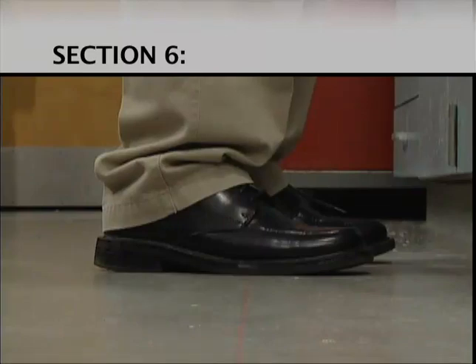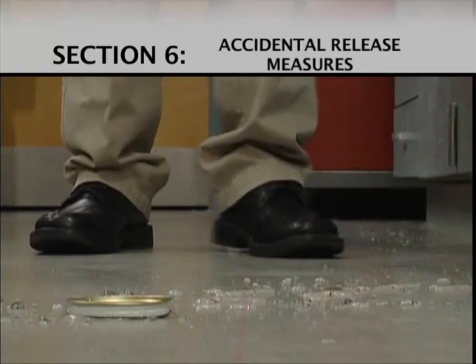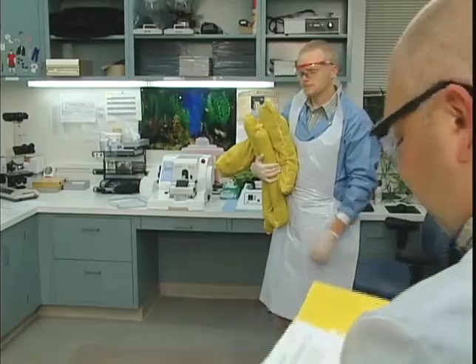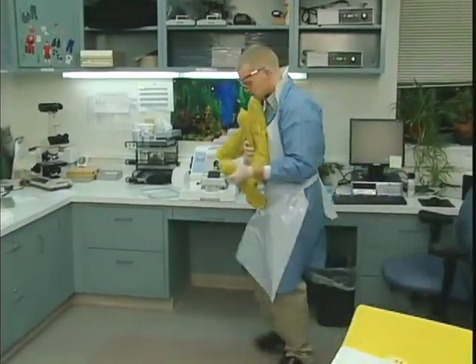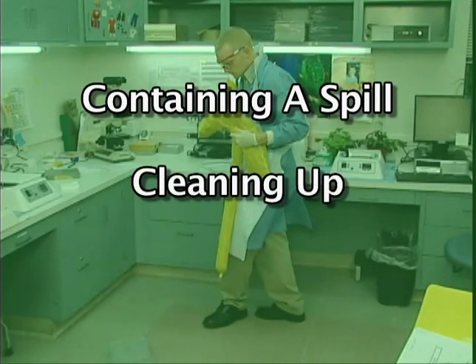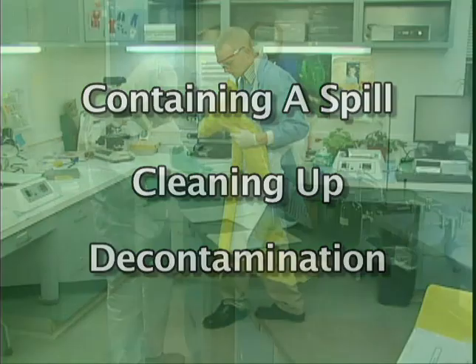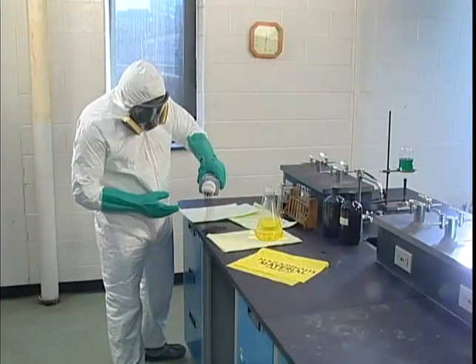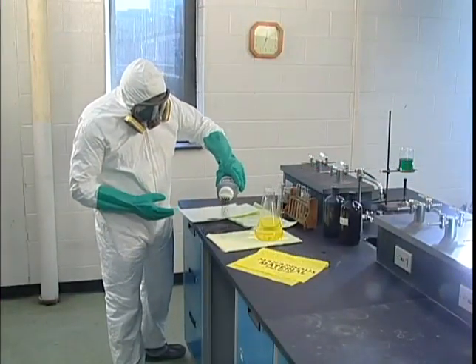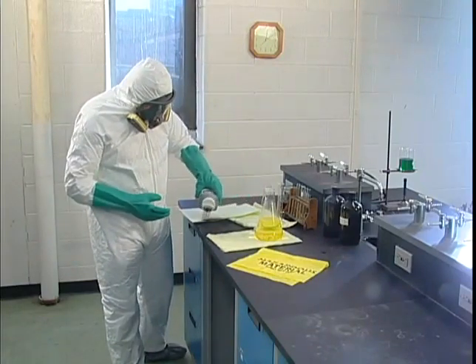Section 6 tells you what to do in case of spills, leaks, and other accidental releases of hazardous materials. Included in this section are general procedures for containing a spill or other accidental release, cleaning up the hazardous material, and decontaminating clothing and equipment that comes in contact with the material. To review, SDS Sections 4, 5, and 6 provide information on what to do if a hazardous situation occurs.